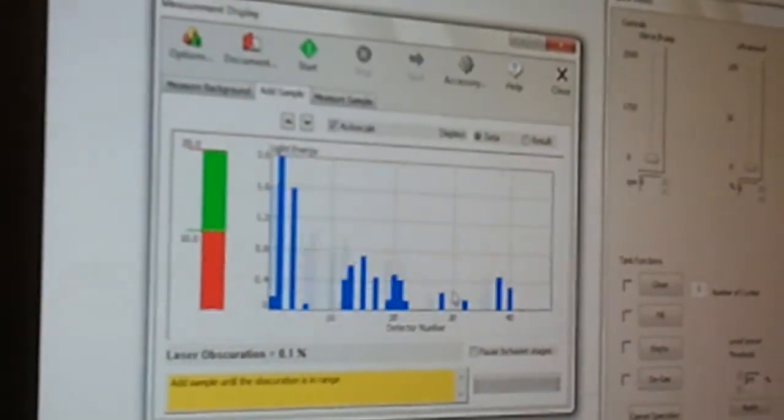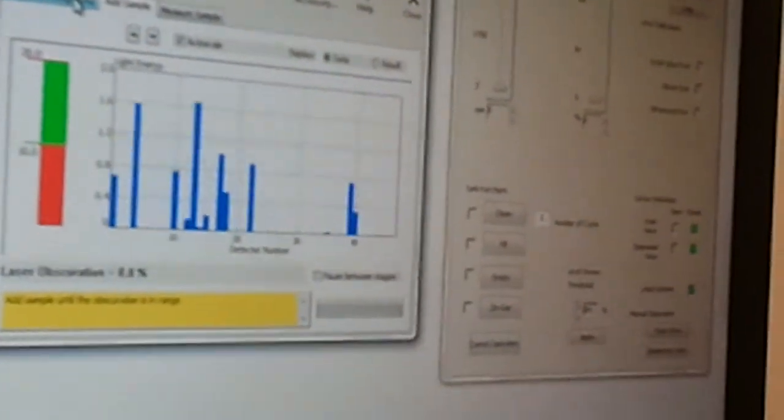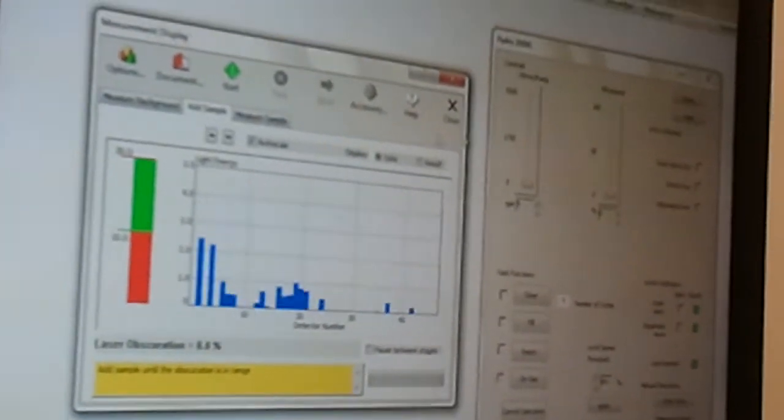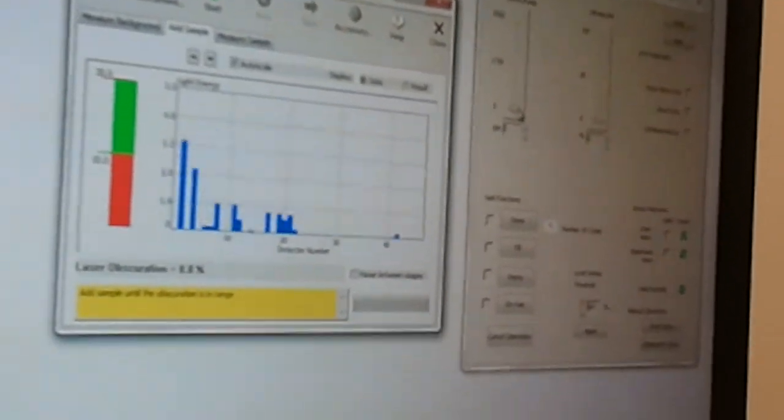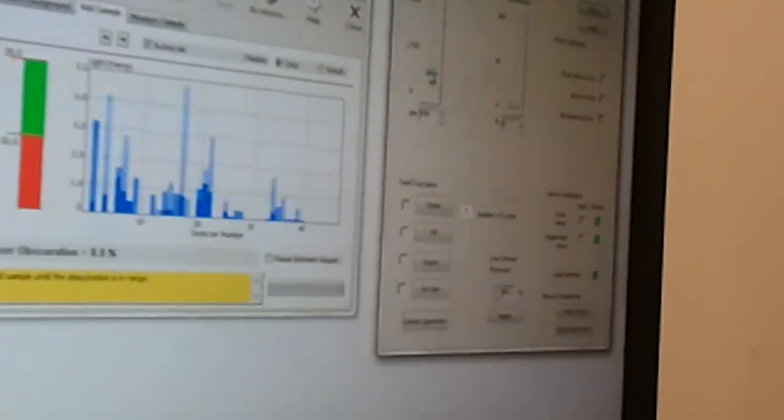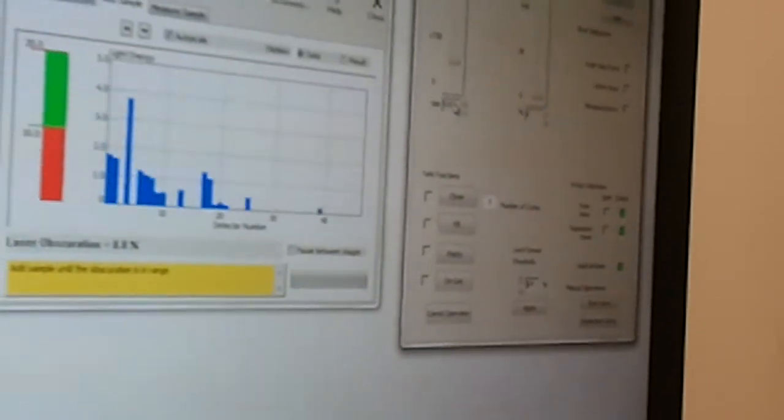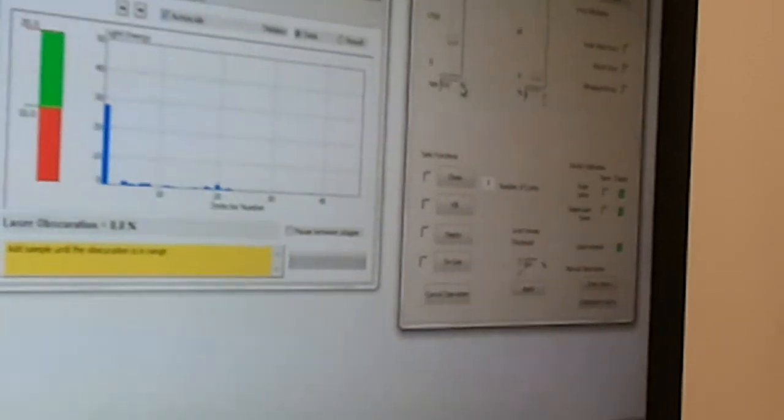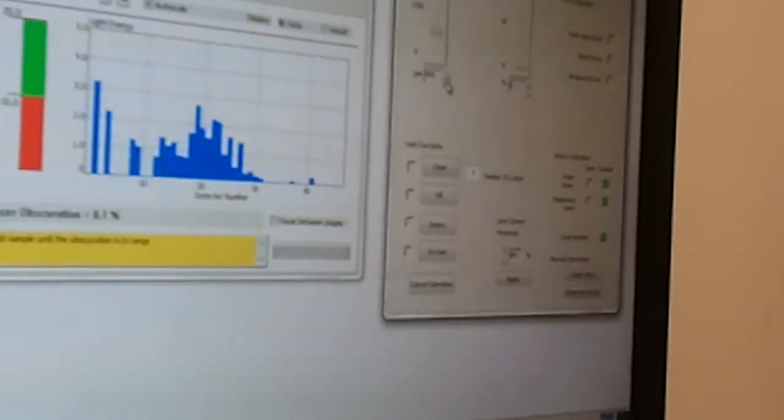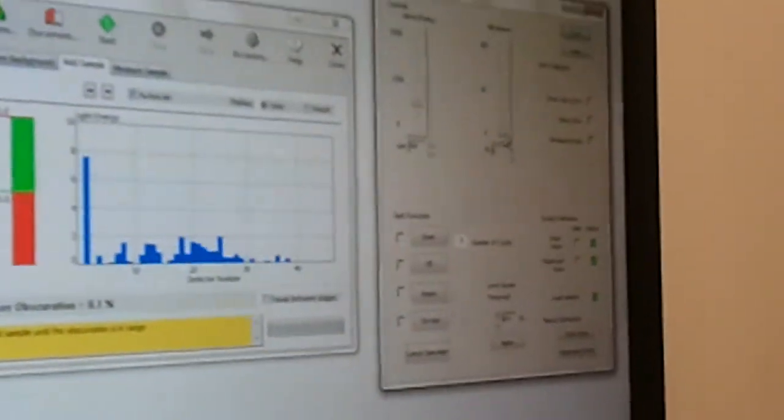Uploading now. So the background was mastered so we're good to go. We're good to go there with the video. So I'm gonna pump up the steer to let's say 1000 rpm or so, 900 rpm. And then this guy here to 15%.